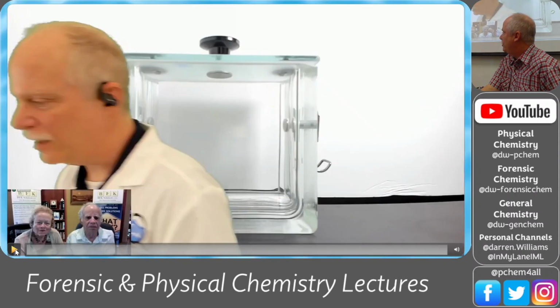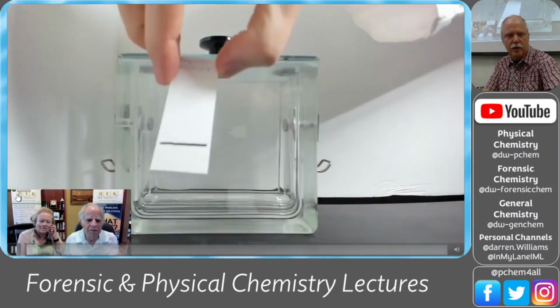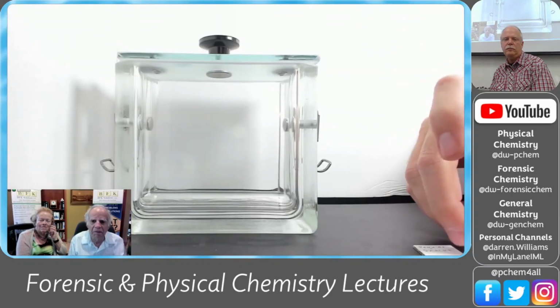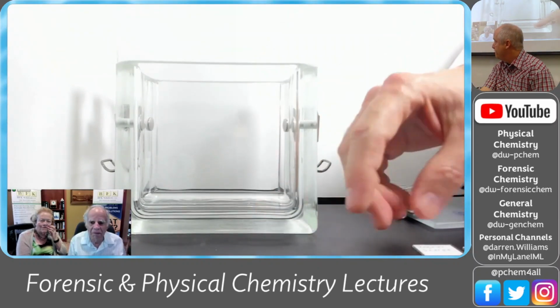So we're just separating the inks in Sharpie. Here we put the regular Sharpie on a slide, and here we have industrial Sharpie. And we have an elution chamber filled with ethanol. Well, it's not filled, it's just got a pool of ethanol in the bottom.